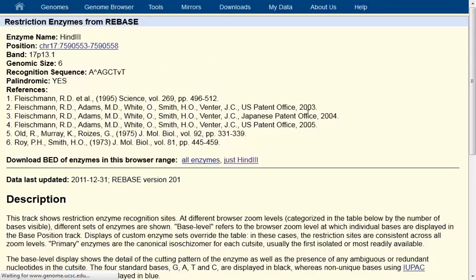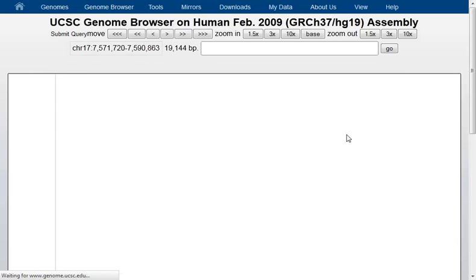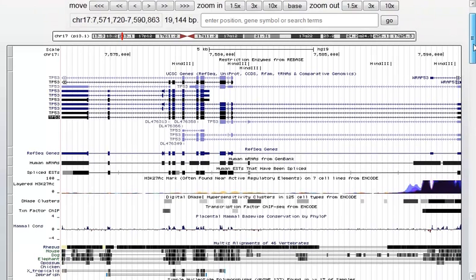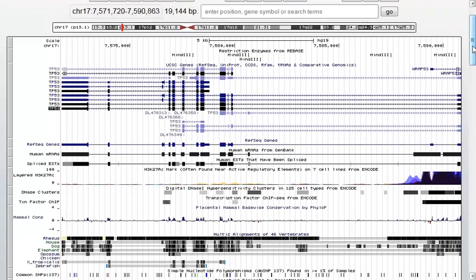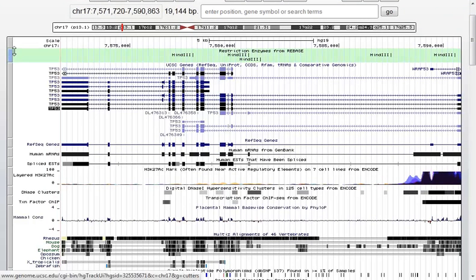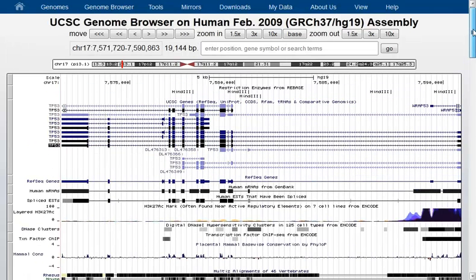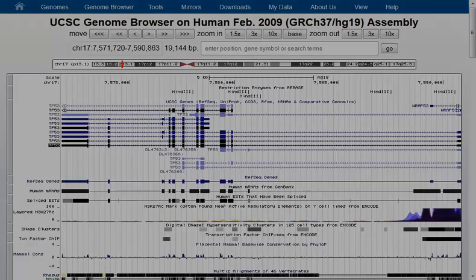I just wanted to help people understand that restriction enzyme data is available in the UCSC Genome Browser, and there are ways you can alter that view to filter and obtain more details as well. So, in the UCSC Genome Browser, that's how you find restriction enzyme information. Thanks very much for your time.